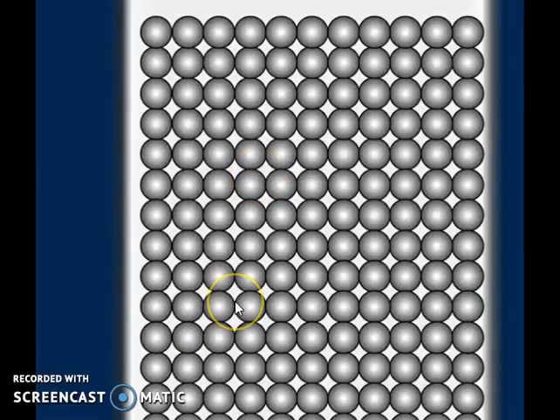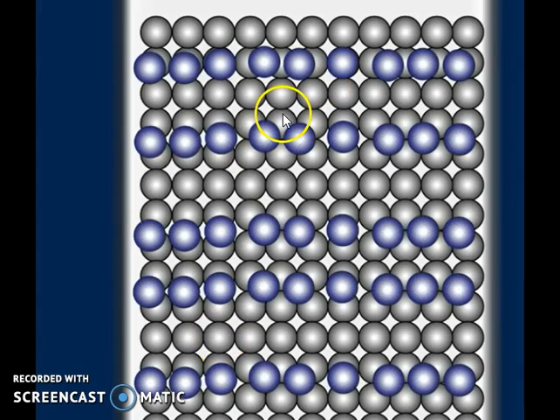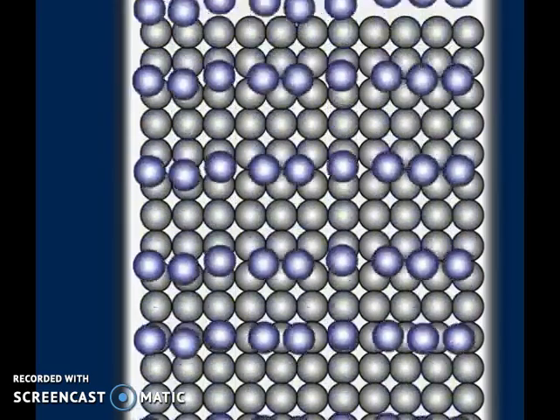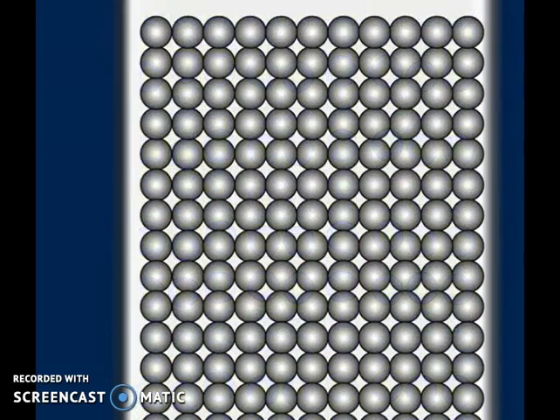So in the column, there is properly packed and loaded calcium carbonate as such. And these are the moving mobile phase for animation purposes. So just remember that the mobile phase is constantly moving, so I've taken that picture out, but just remember that it keeps on moving.